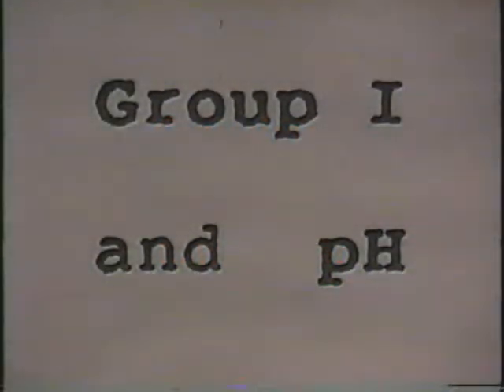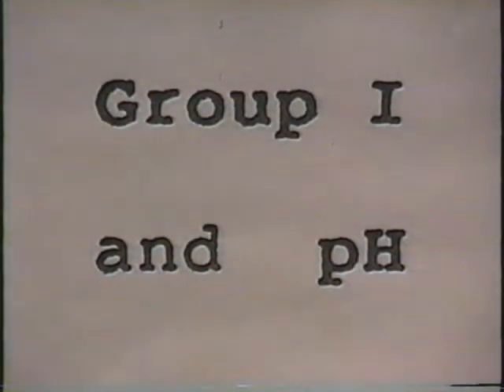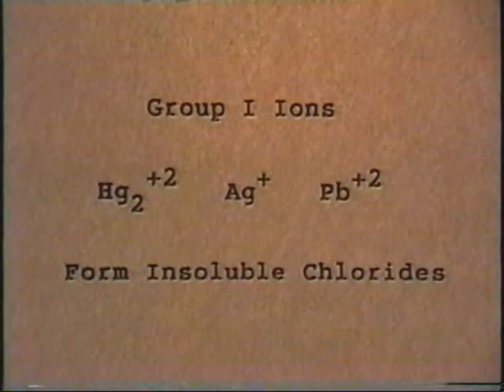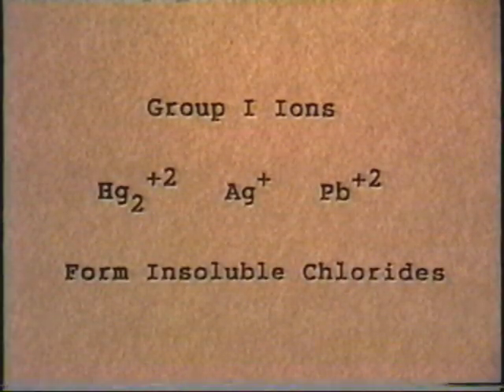Well, today's really lucky day. You get to play a double header. Two completely different experiments all the same day. We'll start with the qualitative analysis for the group 1 ions.